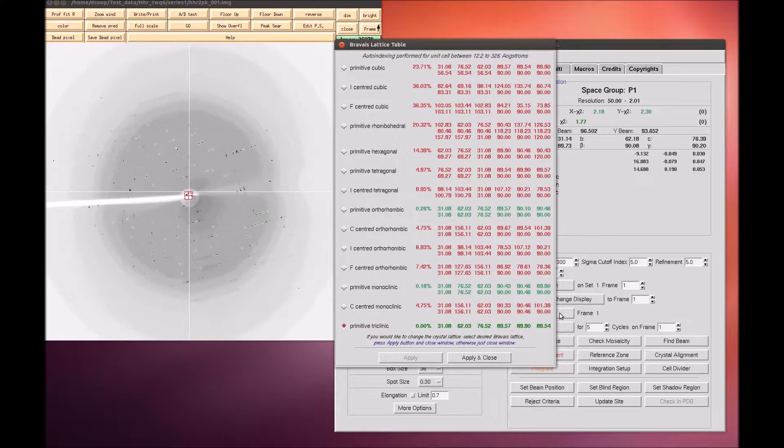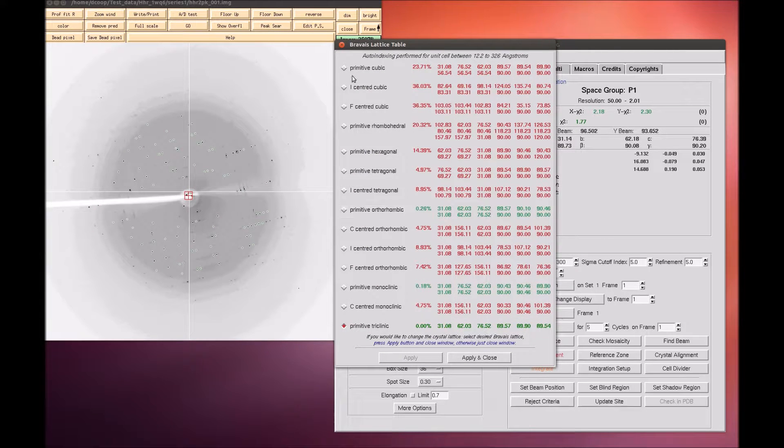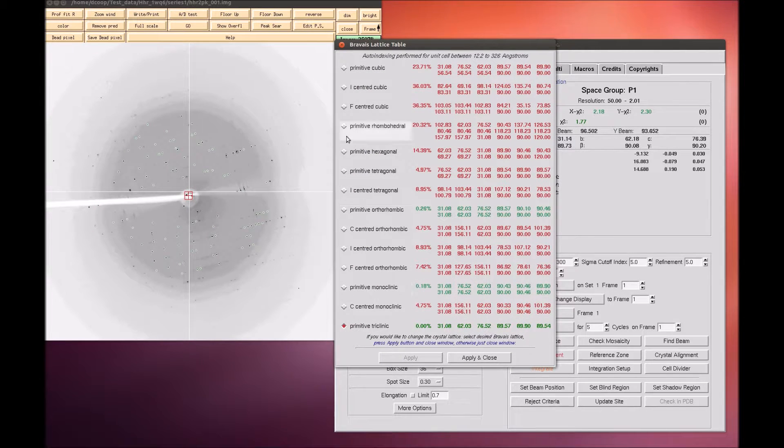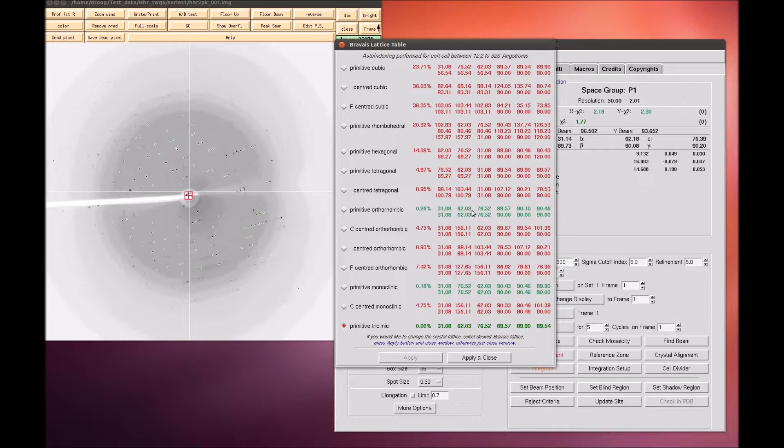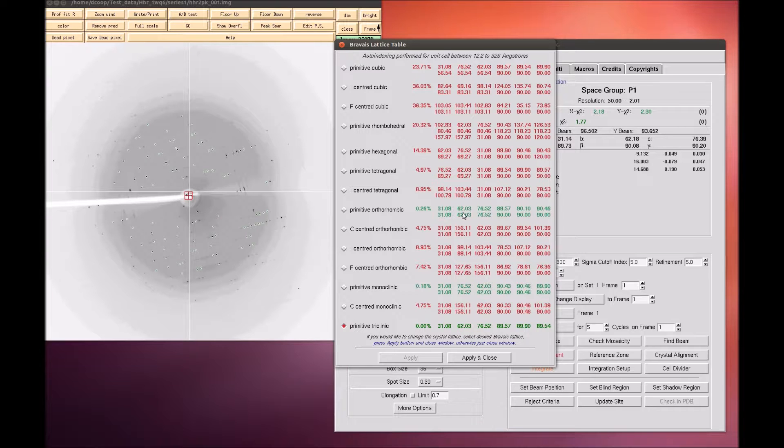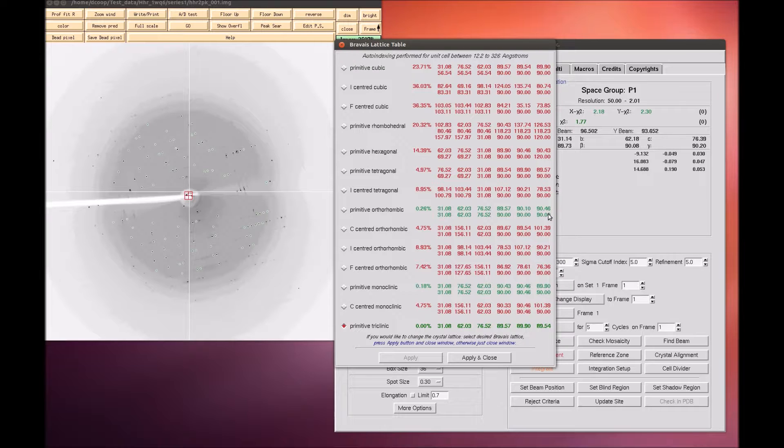The Index button will try to auto-index the peaks into all of the Bravais lattice types and presents a table with the Bravais lattice types ordered from higher to lower symmetry from top to bottom. Each crystal class is presented with two unit cell values. The top is a primitive triclinic unit cell that fits the data and is closest to the unit cell that is compatible with that crystal class. And then the second row is the unit cell that would be necessary for that crystal class.